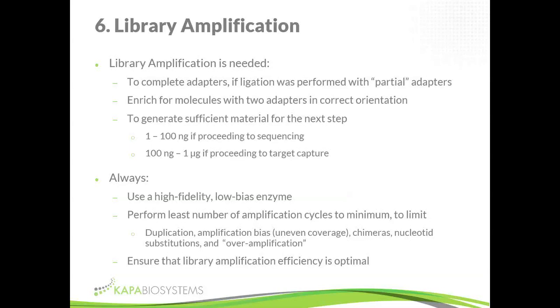It binds, makes a little bit of DNA, falls off, and when you start getting overlapping sequence, you can very easily start with one molecule and end with another molecule, either from the same region or from a homologous region. Those are experimental artifacts, so they don't map to the sequence and you lose them. And so the more PCR, the more chimeras.